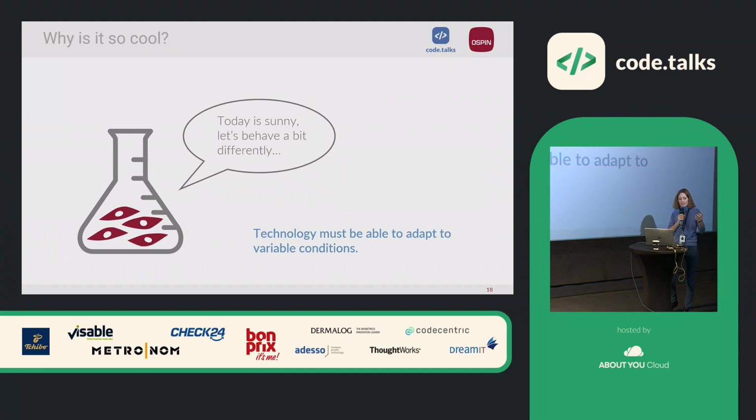basically cells are a living system. If you talk to any biologist, they will always say, yeah, they never behave exactly the same. Even if you're doing exactly the same thing, it can always happen that they do something they're not supposed to do, something slightly different. So in that sense, it's a good idea to introduce some intelligence into the system, to be able to interact or react to what is happening in your experiment, and not just, if your cells don't follow what they are supposed to do, screw up your experiment.